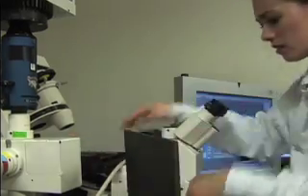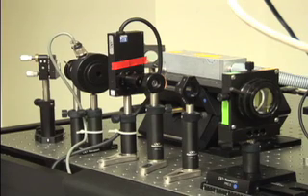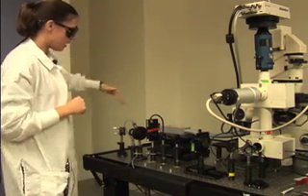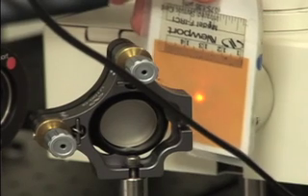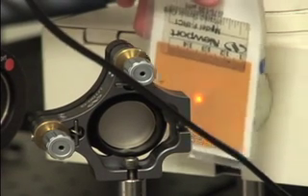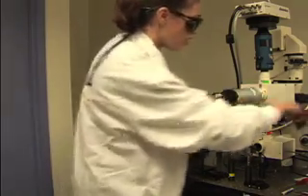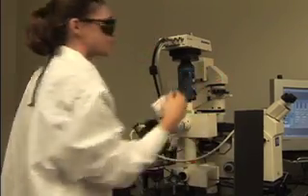She used a laser and microscope setup to determine how fast sperm move. So we start with this laser, it's an infrared laser, so we can't see the laser beam, but it's being bounced off these mirrors and through these lenses and actually is coupled into this microscope. And you can see it here as it enters the side port of this microscope. As it goes through all the lenses within the microscope, it comes up and goes through that objective.